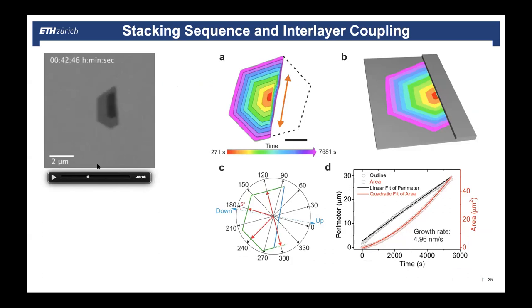And the beautiful thing is you can easily model how graphene grows. You have zigzag edges where graphene is attaching, but the zigzag edges are very, very stable, so they're growing relatively slow. Then you have other directions that are growing faster. So you can actually model the growth quite nicely. I will show that a bit later. And we just looked at the evolution.